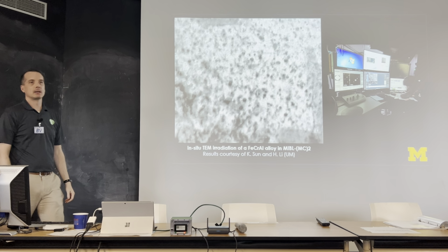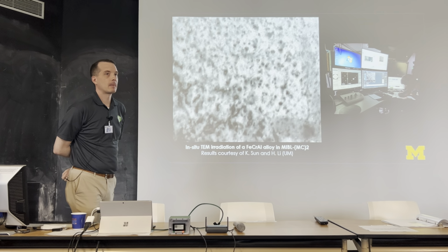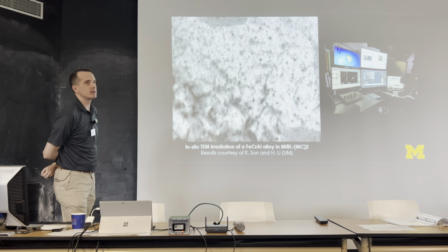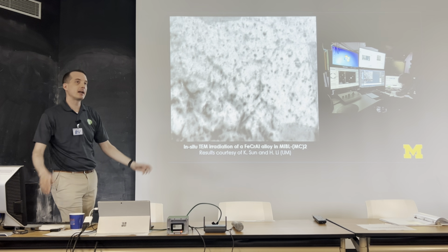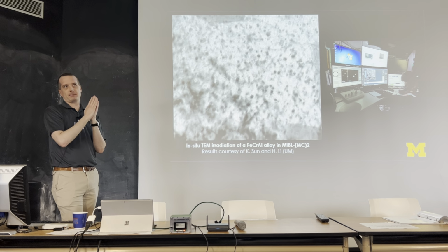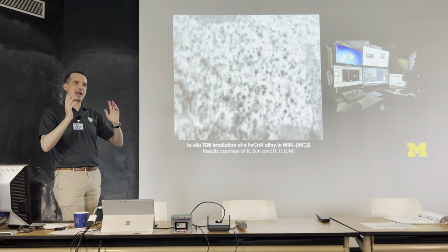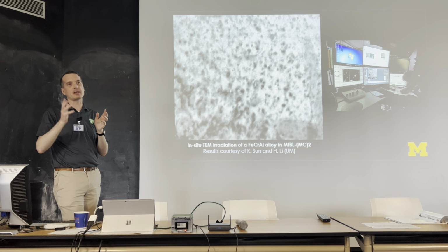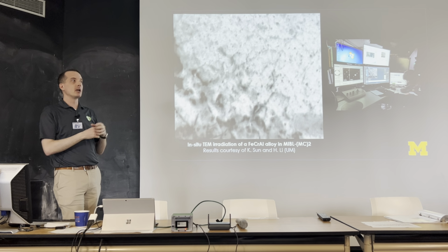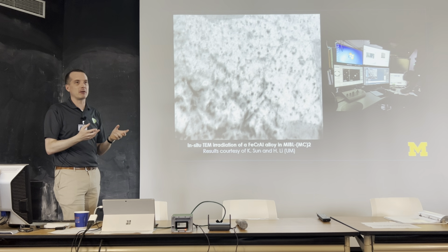I'm just trying to square away that with your video where the physical processes were happening in the picosecond time. Yes, so that was the simulation part, and they're trying to figure out that they can't at the moment because your detectors are going at, well, they have new detectors that are coming out that will be up to 500 frames a second to 1,000 to 10,000 frames a second. So they will be able to capture things like that, but their current workflow, which we'll get into in just a moment, doesn't allow them to capture that level of event.